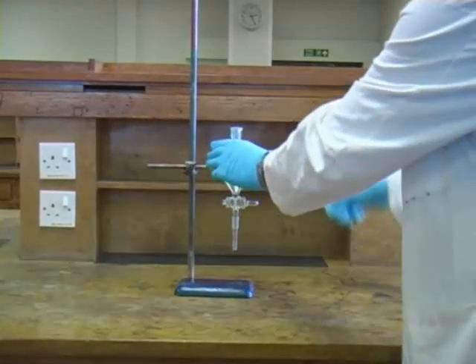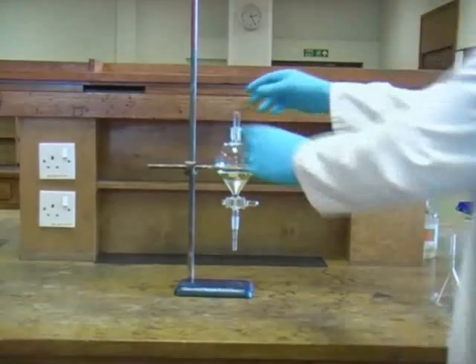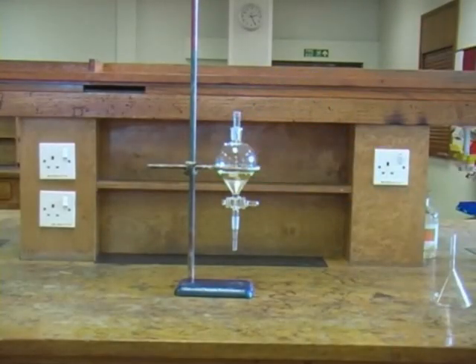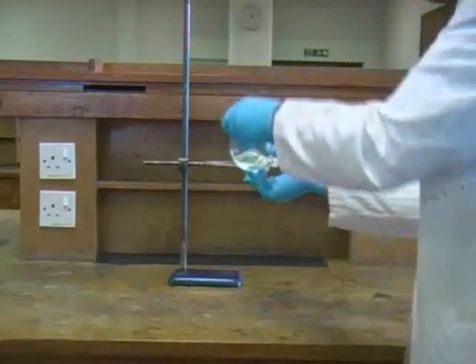Next you need to place a stopper in the neck of the separating funnel and you must ensure that you don't allow this to fall out at any point while you're handling the apparatus. Secure the stopper with one hand and carefully invert the separating funnel.